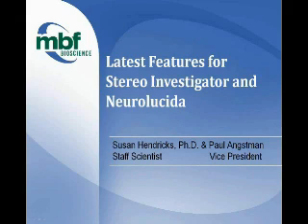As I looked over the list of attendees, I saw many of you that I've met at previous SFN meetings and a number that I spoke to over the phone in the past several years. I'm really excited about version 10. Our spectacular and wonderful development team has done a terrific job adding new tools and improving existing ones to make you even more efficient and help you get more work done.